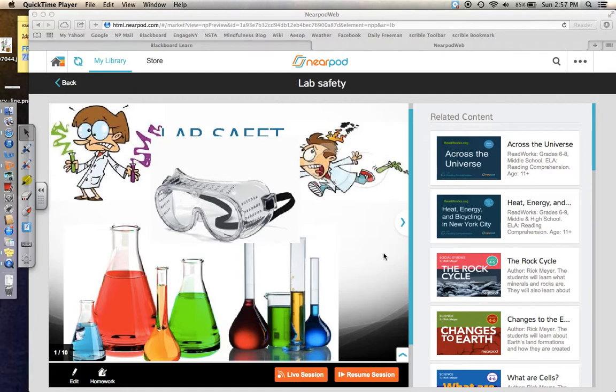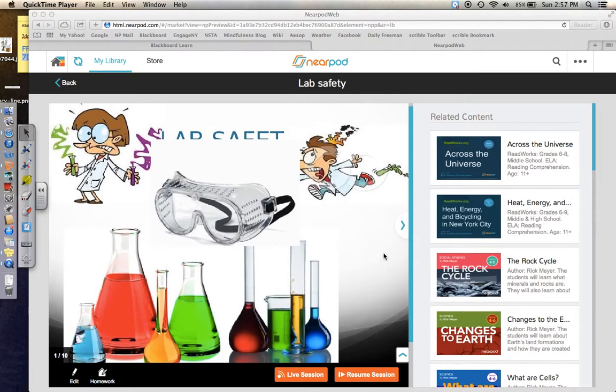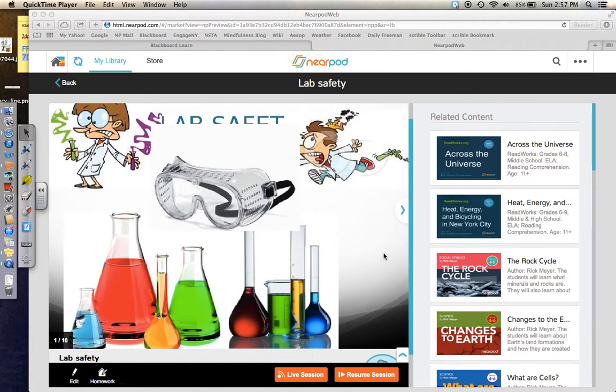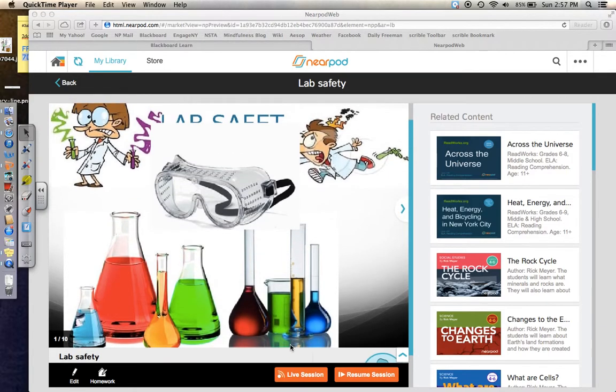But anyway, in this lesson, students are going to be learning about lab safety. This would be done in the beginning of the year and it's meant for 6th graders. So here is the opening slide. Now I also said by the end of the lesson, we'll have a class set of safety rules for our lab. And it's a brief presentation.